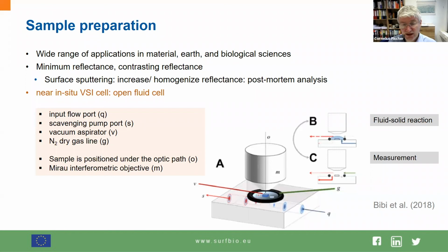If this is not available, or the reflectivity is too low, you can do at least a post-mortem analysis. You can cover the surface, you can coat the surface with, as an example, gold or palladium, and you could then do at least a post-mortem surface height analysis.